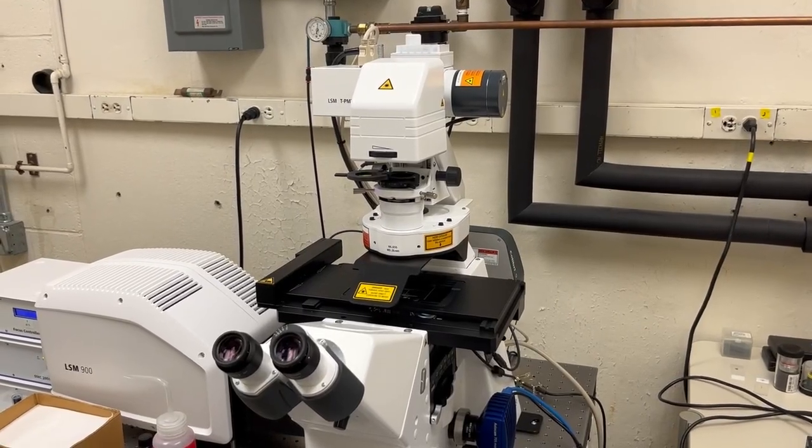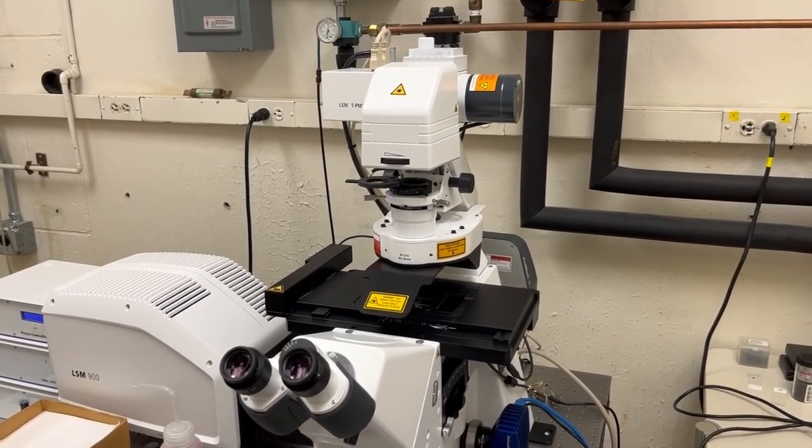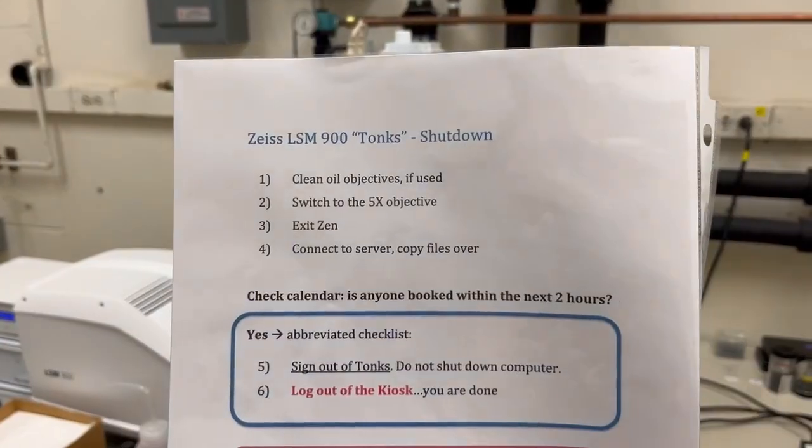This video will show you how to shut down the LSM 900 Tonks. We're going to follow the instructions on the shutdown checklist.